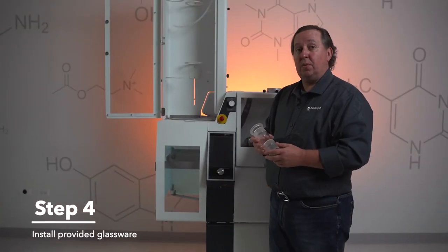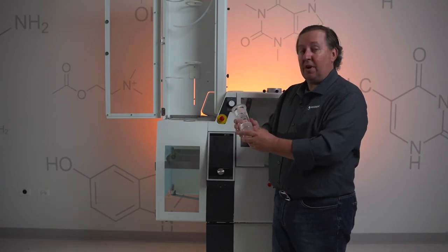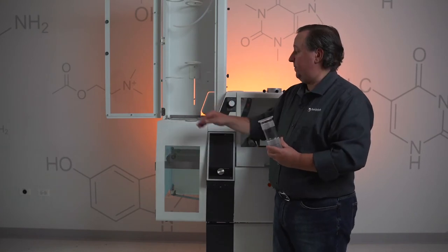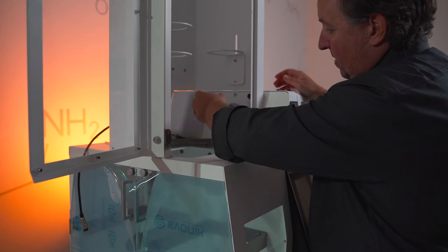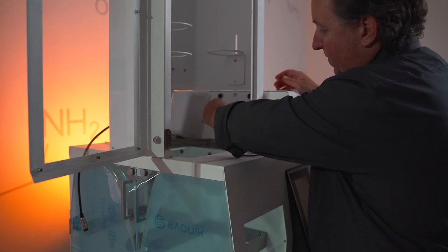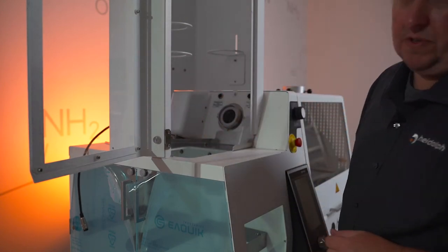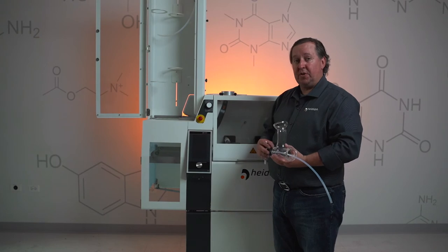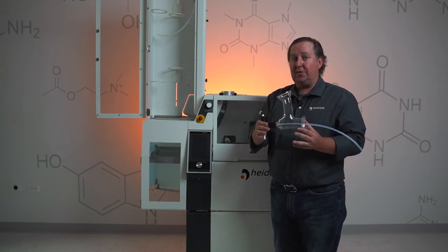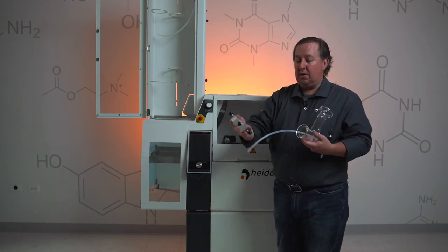Step four, we're going to start installing the glassware. We're going to start with our vapor tube itself and then the sandwich seal. Take your vapor tube, slide it in. Take your sandwich seal and place that right on top of the vapor tube. Once you have your vapor tube installed and the sandwich seal in place, you're going to want to grab your A distributor and you're going to need to install your holding clamp.